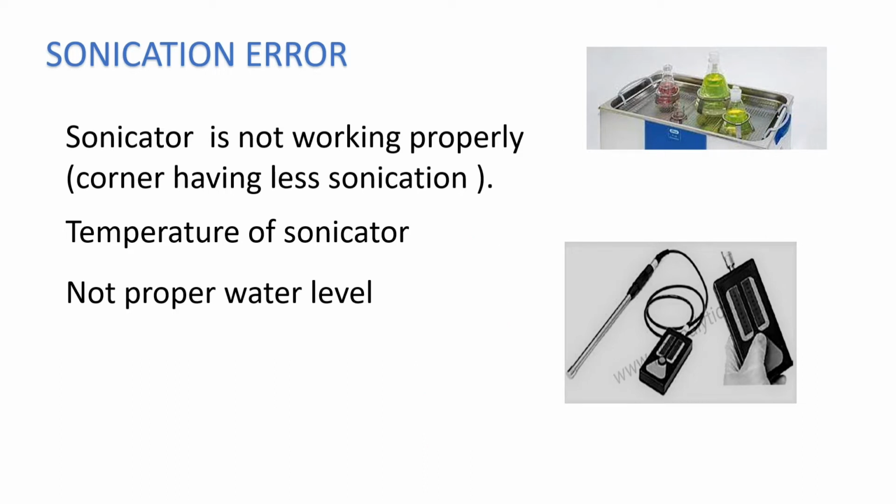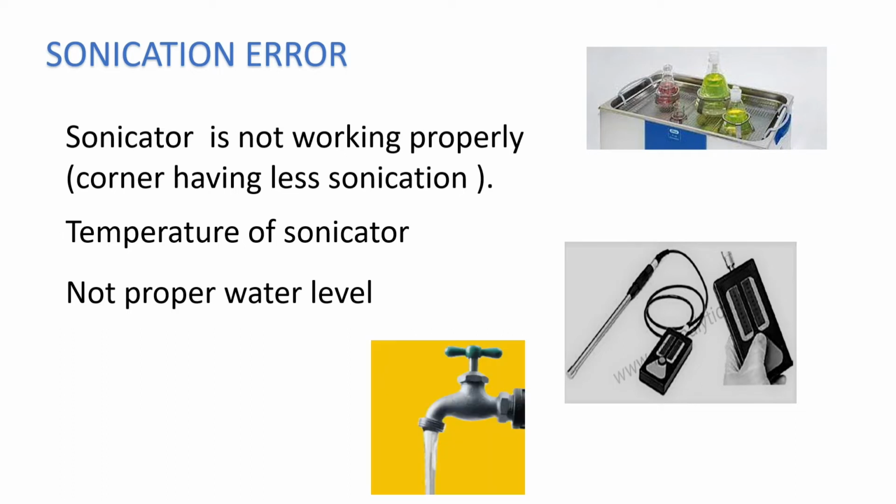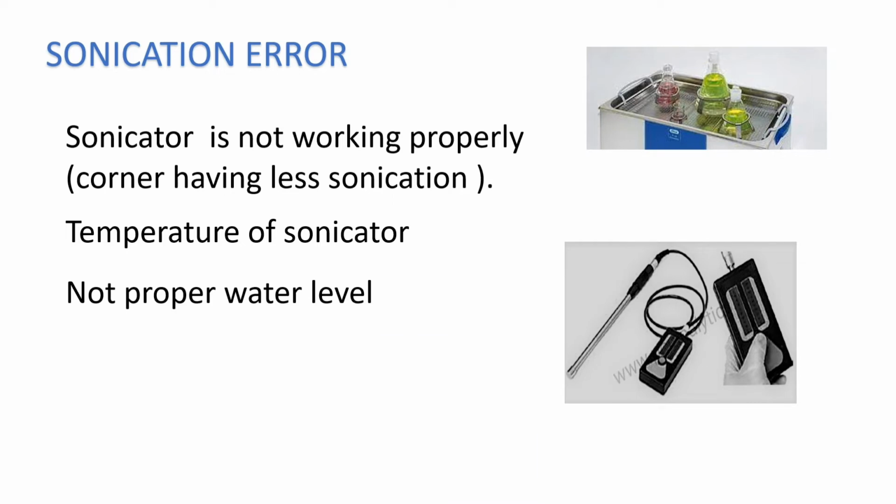In such a sonicator, what you can do is put in a tap water supply that continuously supplies water to the sonicator with the drain also open, and the volume of water has to be fixed in such a way that the water level is maintained.